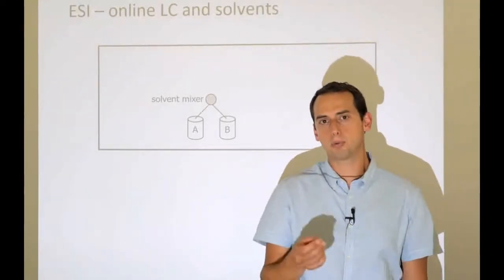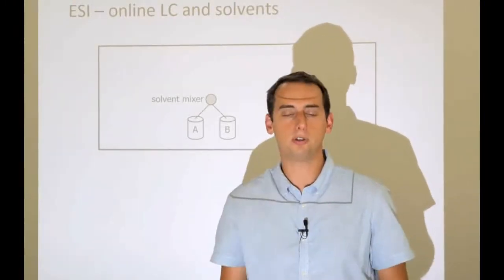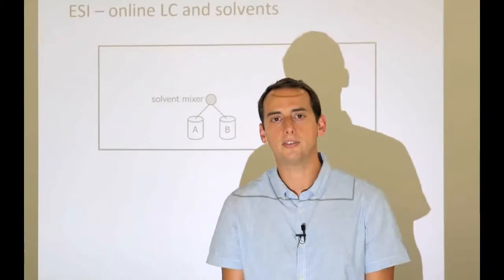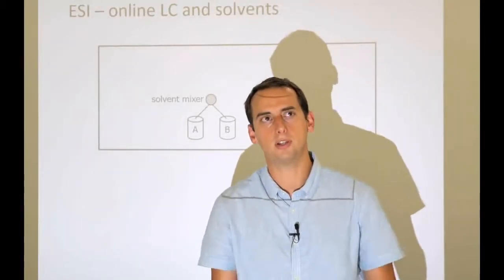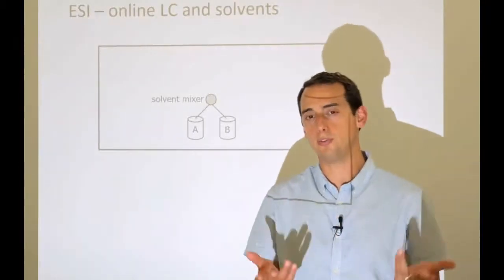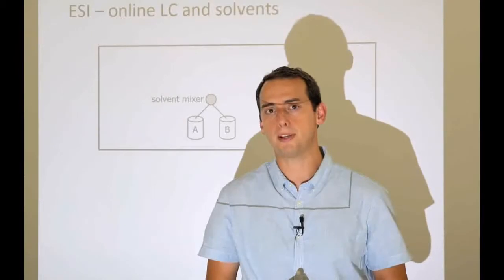These 5,000 proteins, if we cut them into smaller peptides, which we usually do with trypsin, that cleaves after lysine or arginine, which occur roughly 1 in every 20 amino acids each. So the combination is every 2 out of 20, so every 1 out of 10. That is how we come to this average length of 10 for a peptide.